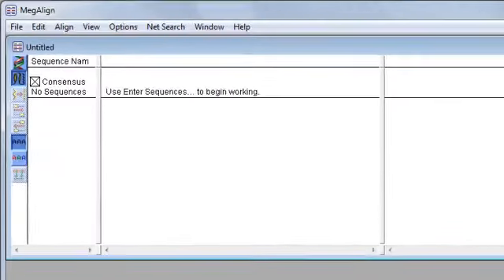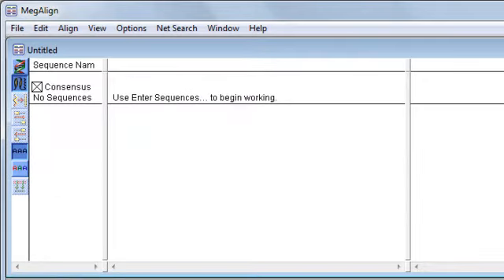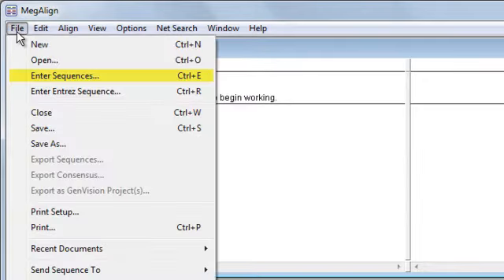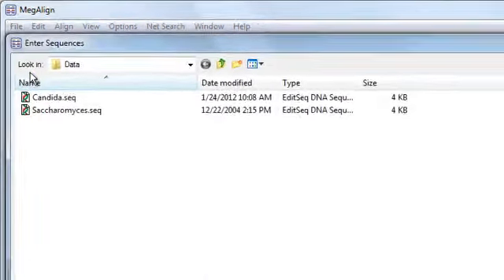The first step is to load your sequences in MegAlign. Do this by going to File, Enter Sequences.